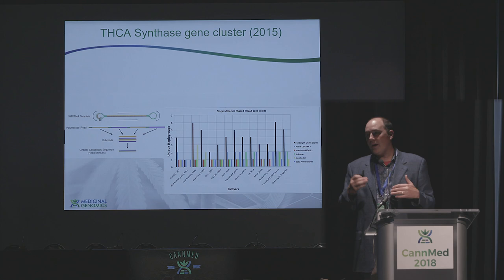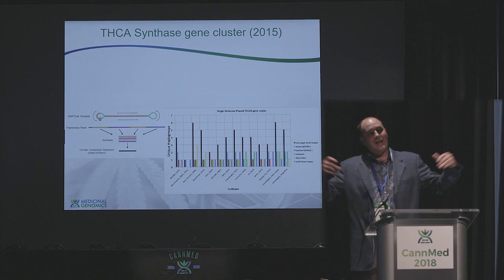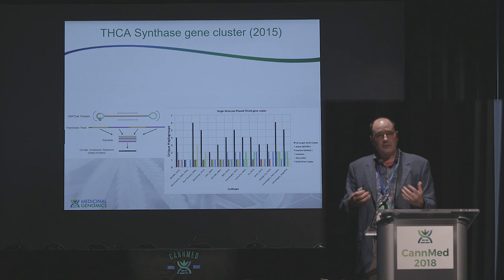But we don't know the order of them in the genome, and I don't know where they go in the genome, and we don't necessarily know if they're fully active in the genome. We just saw that there's a lot of those copies. We then backed those primers out to amplify with more unique regions in the genome, and we started getting much fewer genes coming through, and the ones that were coming through seemed to all be full length. There weren't any stop codons in them, and they looked as if they were really good THC synthase contigs.